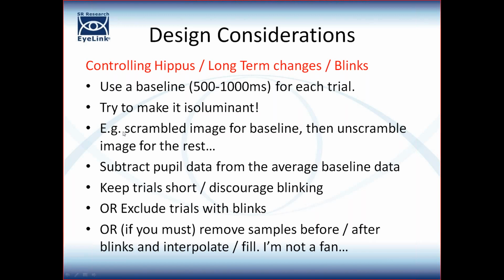And I will show you in a minute, there are again MATLAB scripts that will let you import image files and scramble the pixels basically. And this is a very, very sensible thing to do in my view. But this really is the key idea.